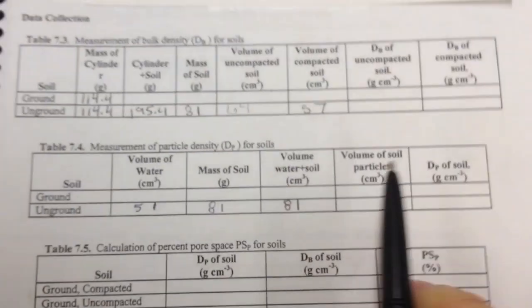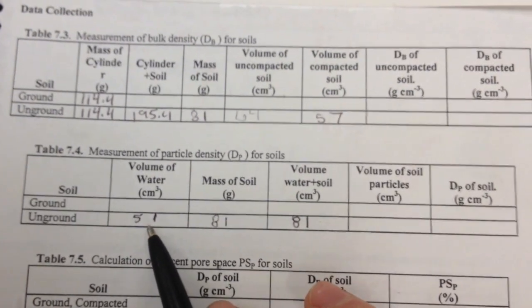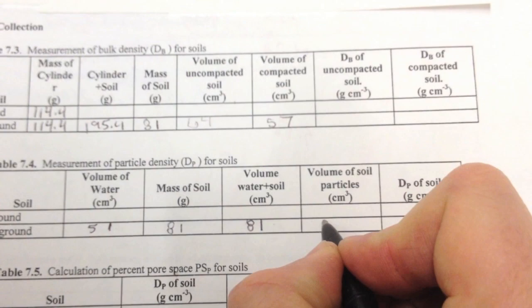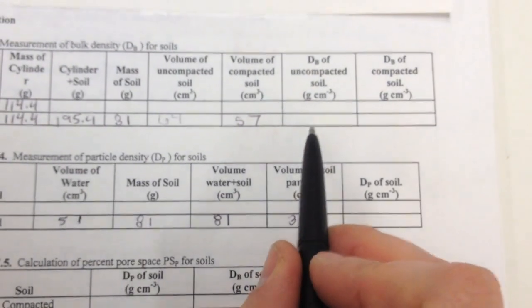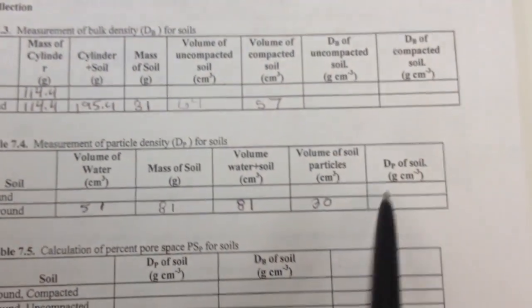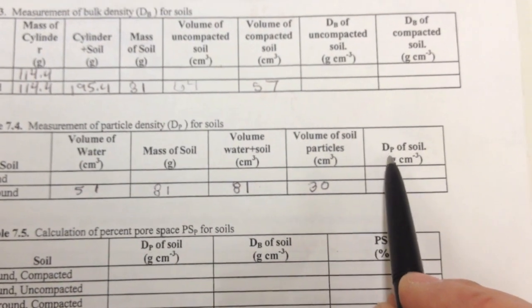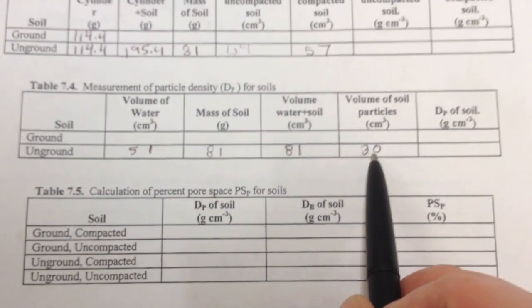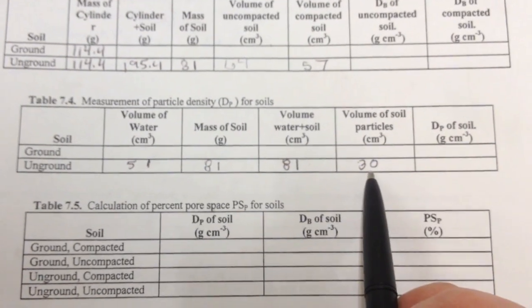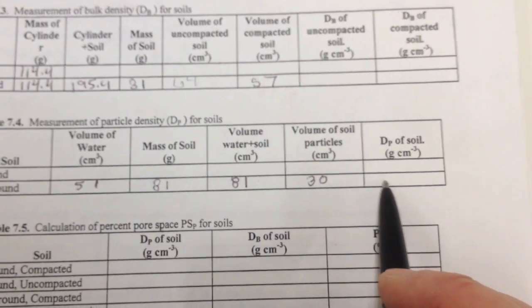The volume of the soil particles equals the volume of water plus soil minus the volume of water alone: 81 minus 51 equals 30 cubic centimeters. That removes the pore spaces — we're looking at just the soil particles. Particle density equals grams of soil divided by cubic centimeters of soil particles: 81 grams divided by 30. That gives our particle density for the unground sample.